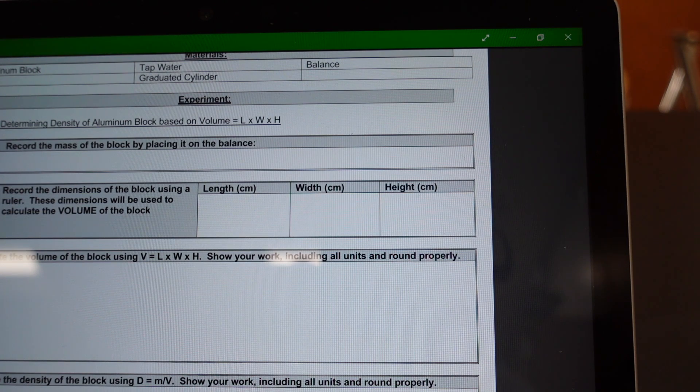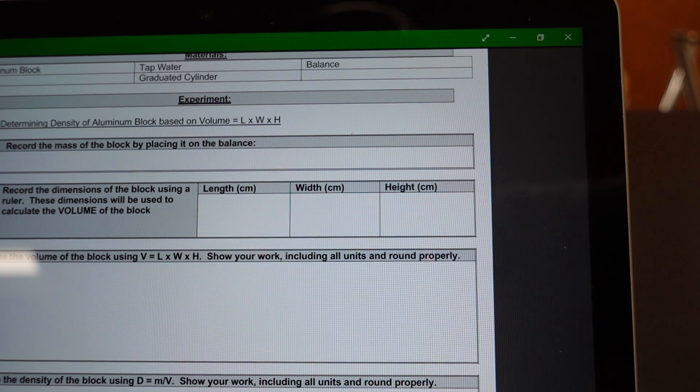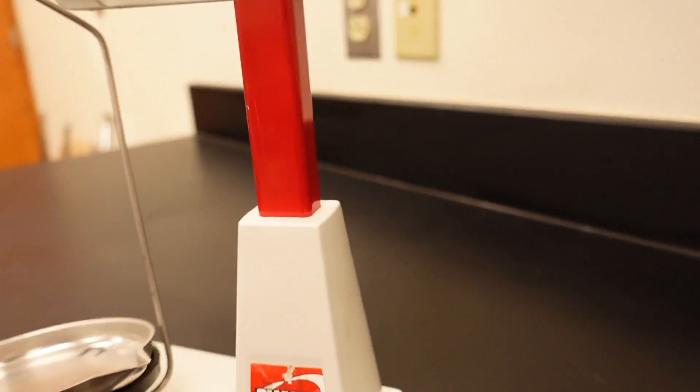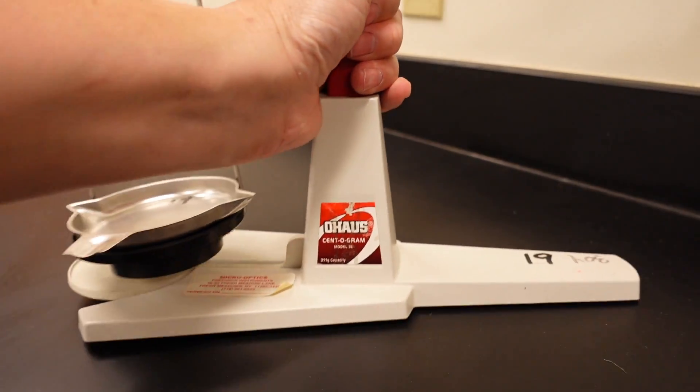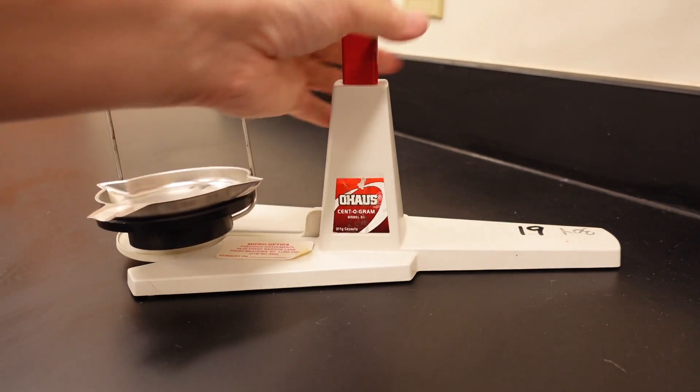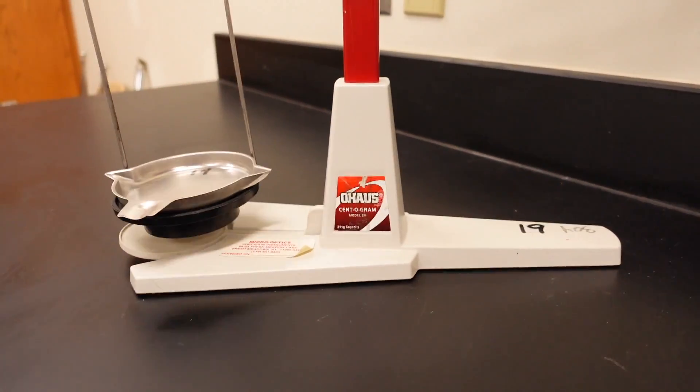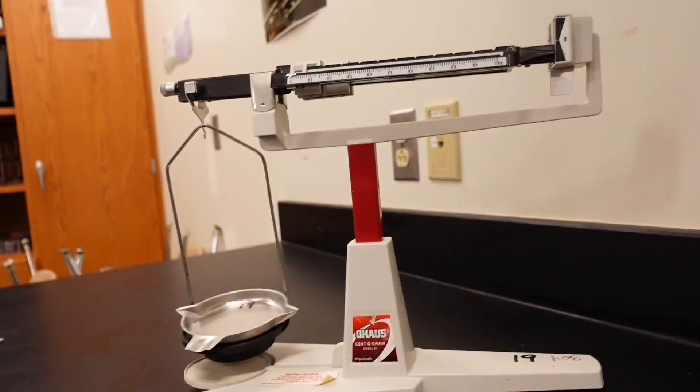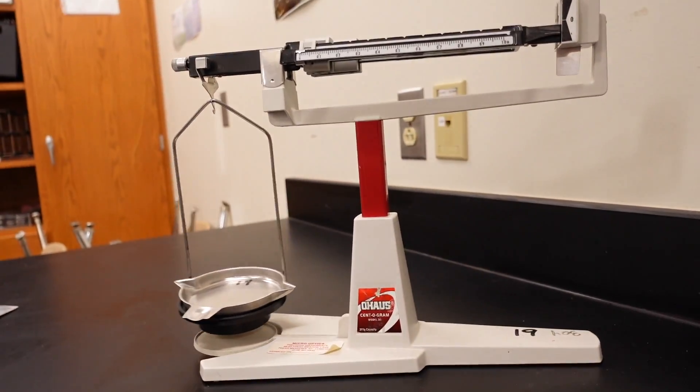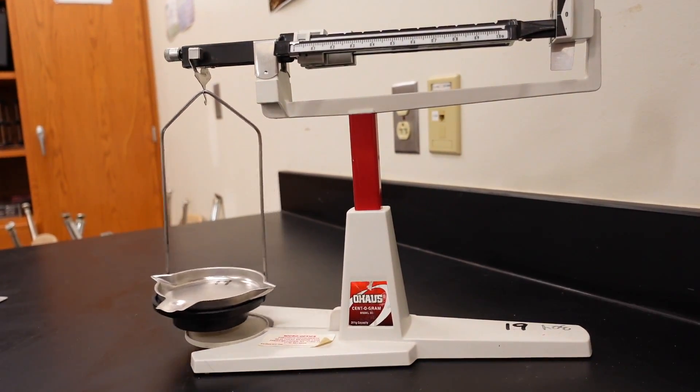So, let me get the balance ready for you. Here we are. Here is the balance. I'm going to move this out. There we go. Get the whole thing in the view. There we are.